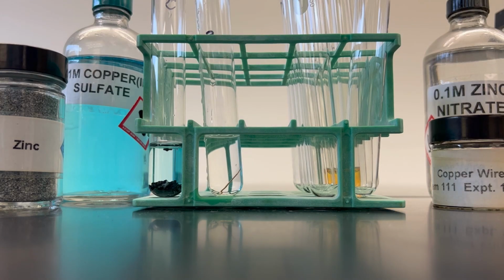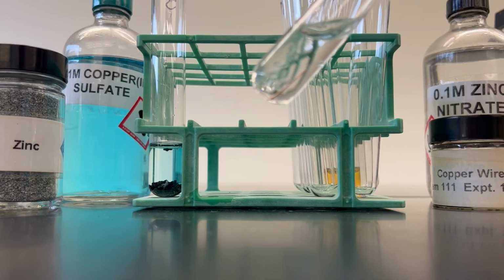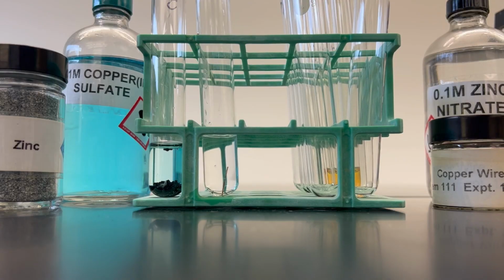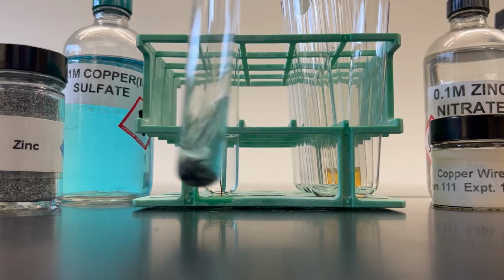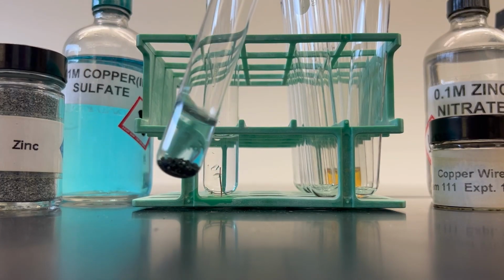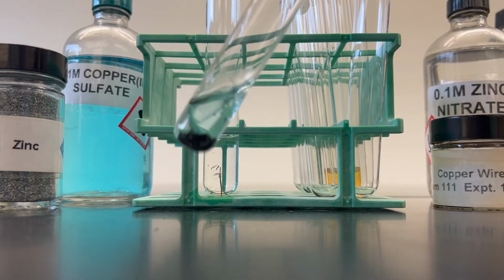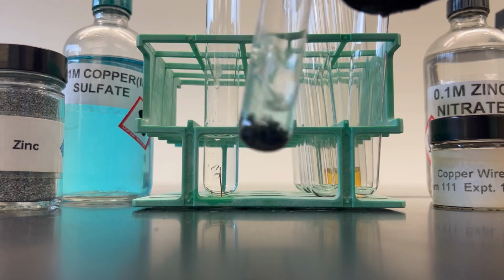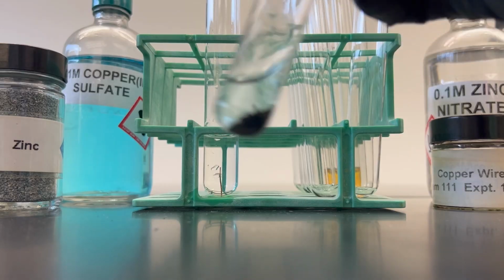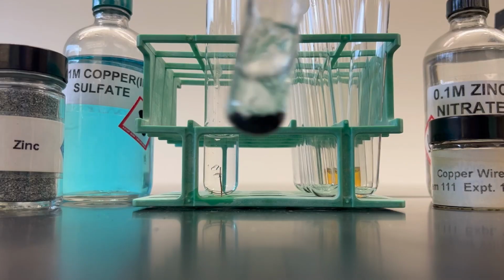Okay, so it's been about 5 minutes. If we look at our test tube that has our copper in it, nothing really changed about that copper. It's still just a clear solution and it's still just copper wire. If we look at our zinc, we notice that it has all these black pieces to it. If I shake it, I can get more of that to come out, some of that shininess to come out. That shows that a precipitate formed and that we had, in fact, a precipitation or single replacement reaction happening with the zinc and the copper sulfate. You can keep knocking off some of that solid and reacting it with more and more zinc.